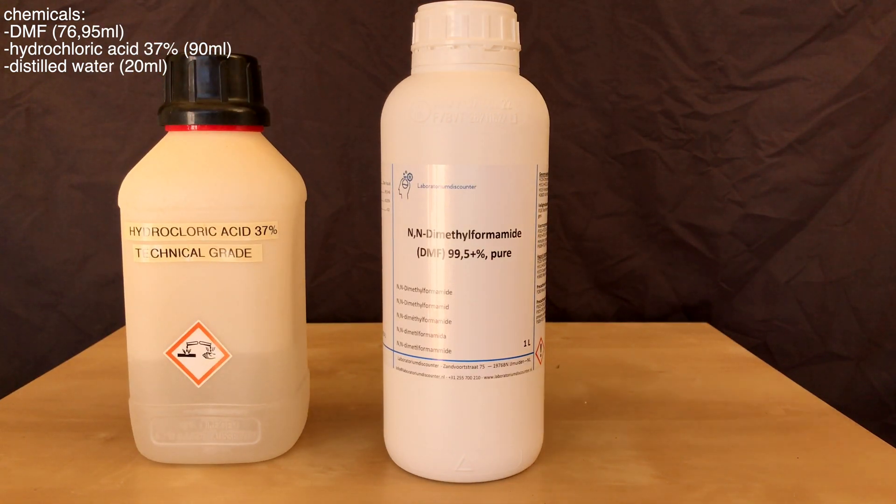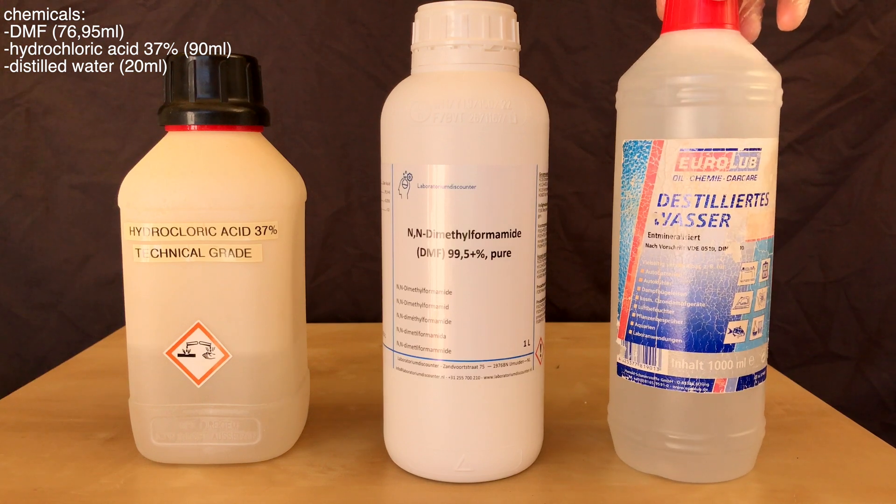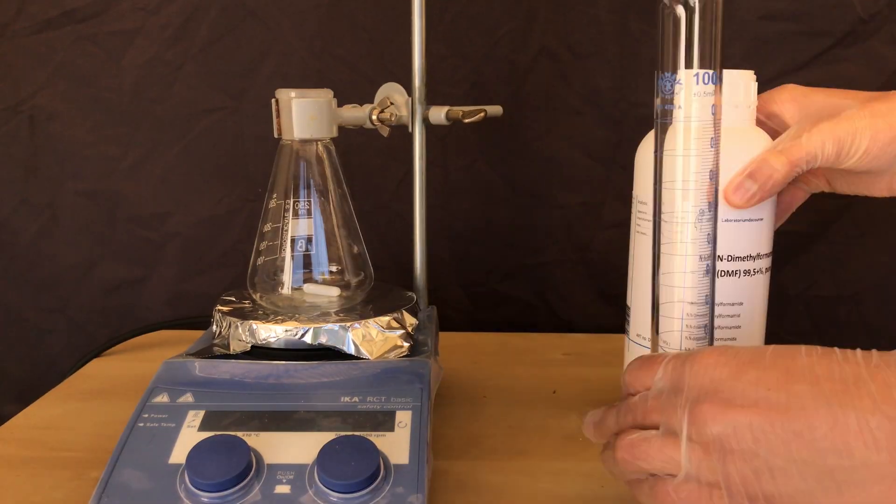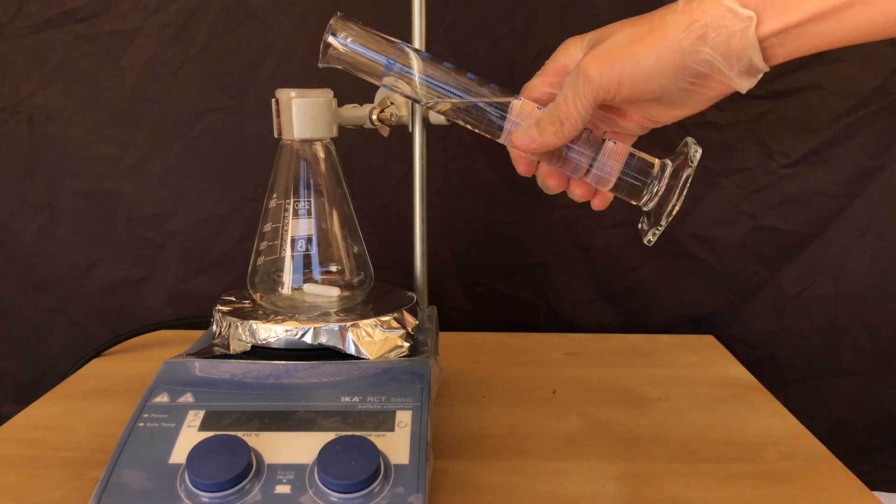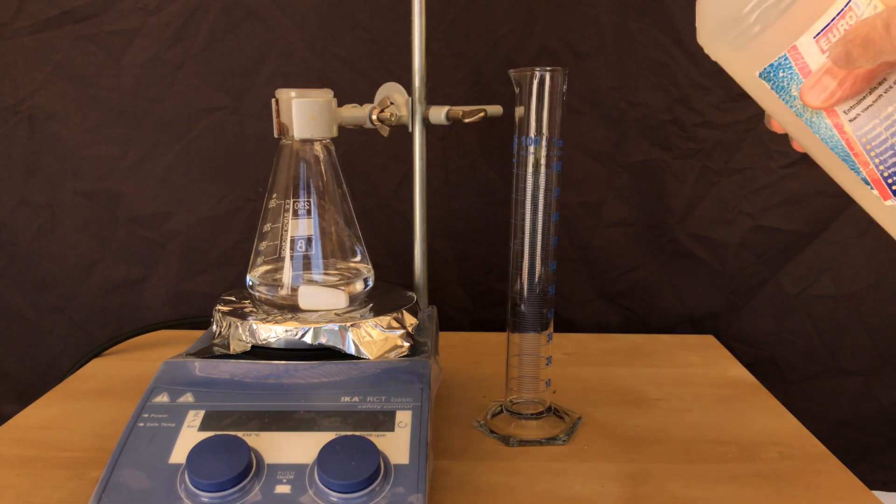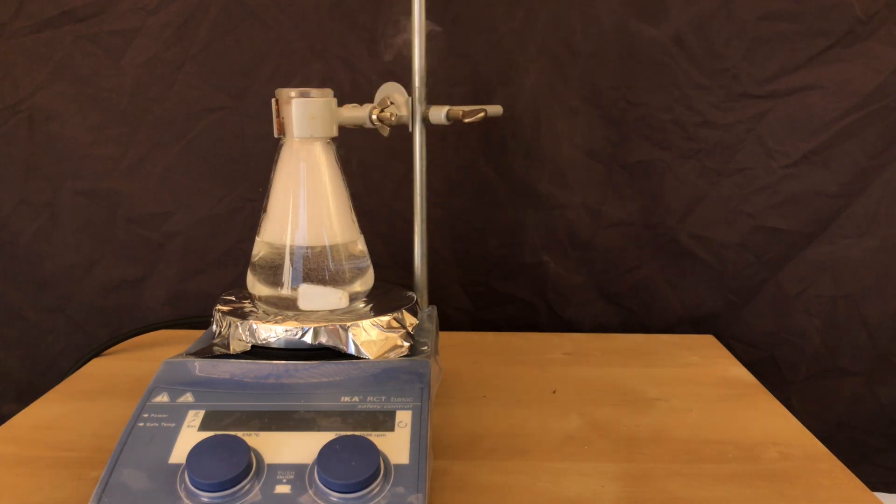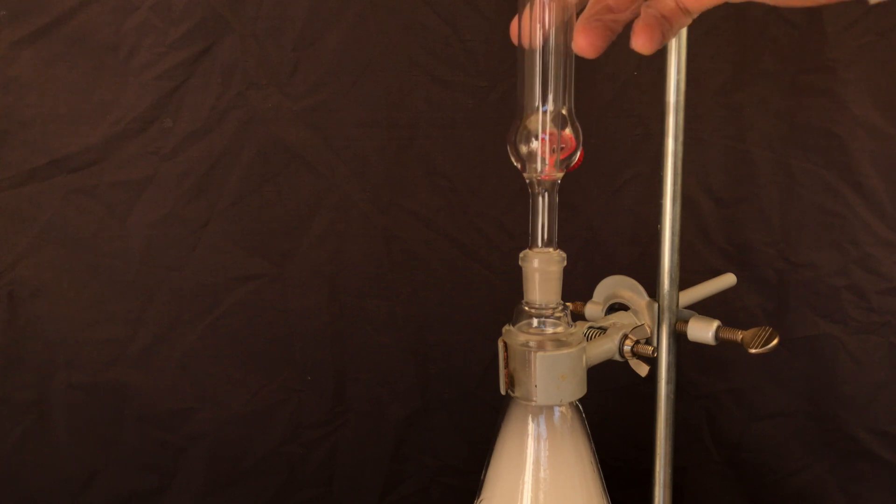This time we used about 77ml of DMF, about 90ml of 37% hydrochloric acid, and 20ml of distilled water. We began by measuring out the DMF and using the same cylinder we measured out the water and the hydrochloric acid. You can see a lot of fumes being produced and this is probably already some of our product.